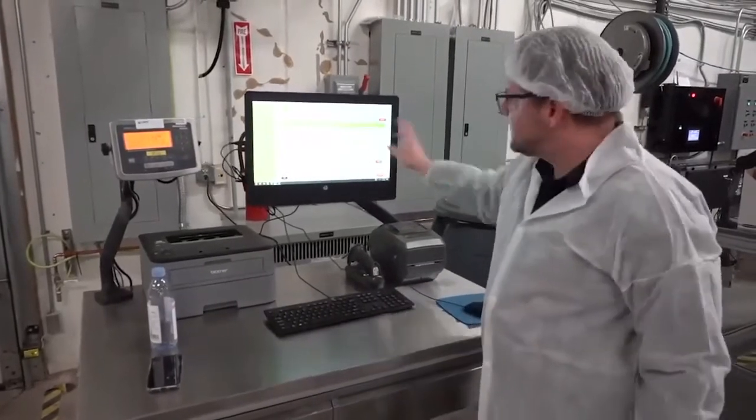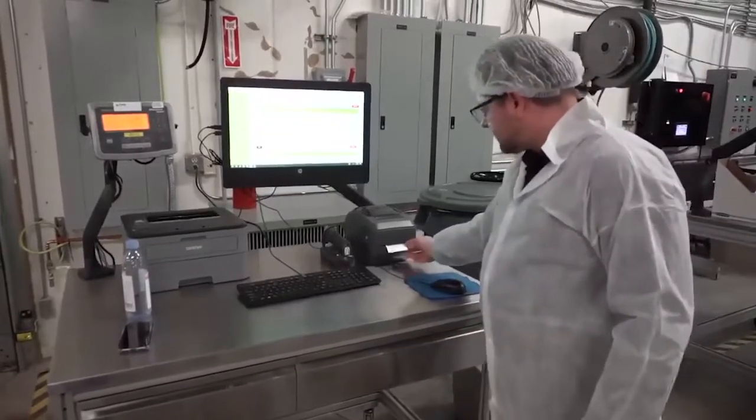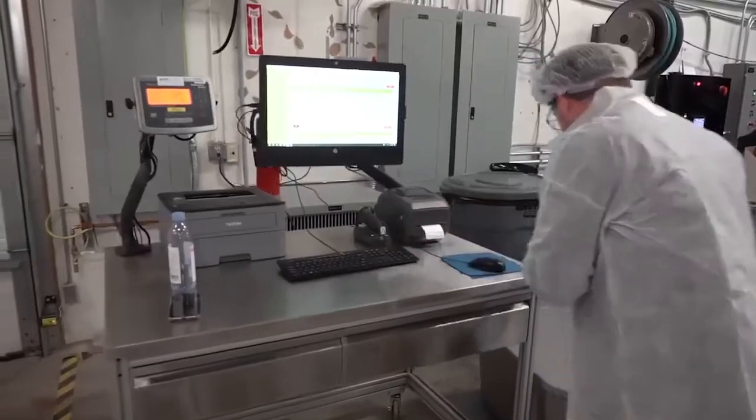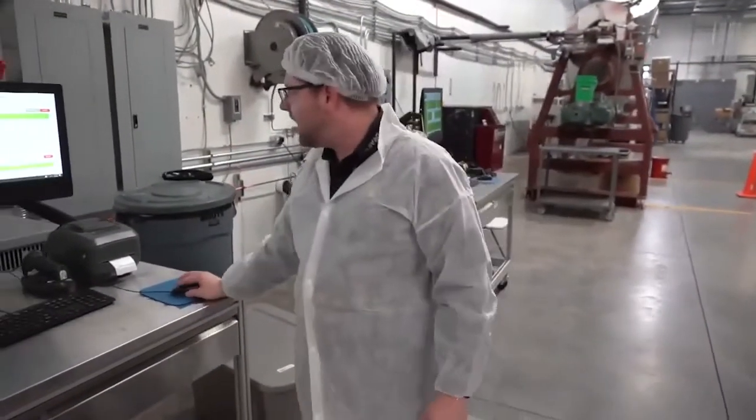I have different container profiles. I add that in and I save it. Then it prints out this barcode here. The barcode then goes on the container, and it now knows what that is. I'm gonna go ahead and close the lot.